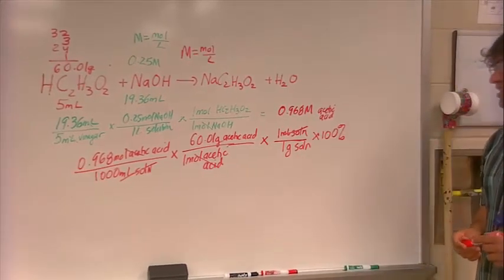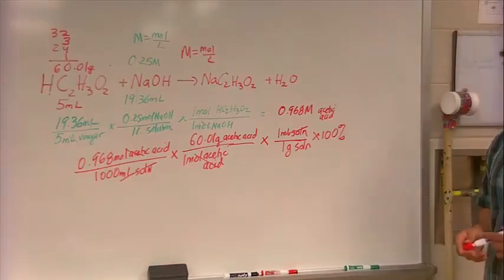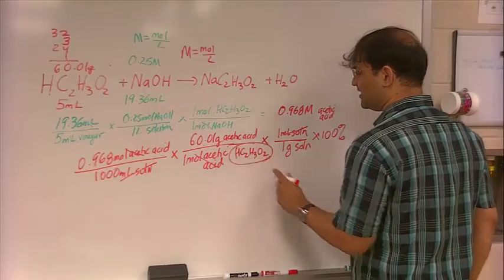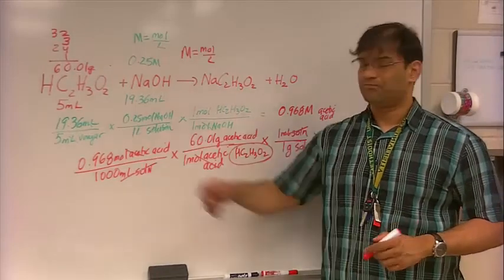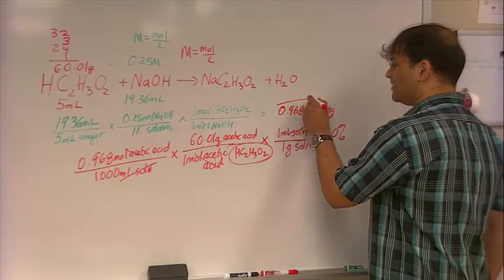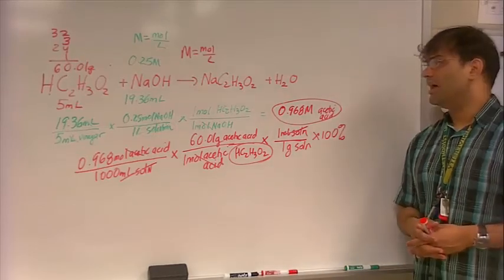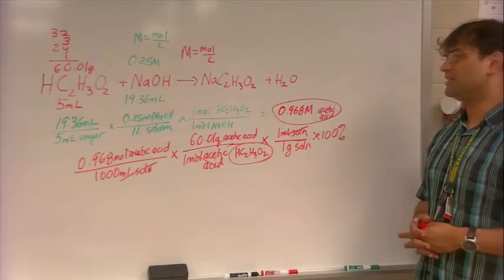So in this case, if you perform this calculation, you should be able to get the mass percentage of acetic acid, which is HC2H3O2, that's the formula for acetic acid, in the 5 mL of vinegar that you weighed out. So this value, again, came from averaging your pH titrations. So make sure you do your pH titrations well. Make sure you do them accurately, particularly around the equivalence point. Okay, you don't want to overshoot.